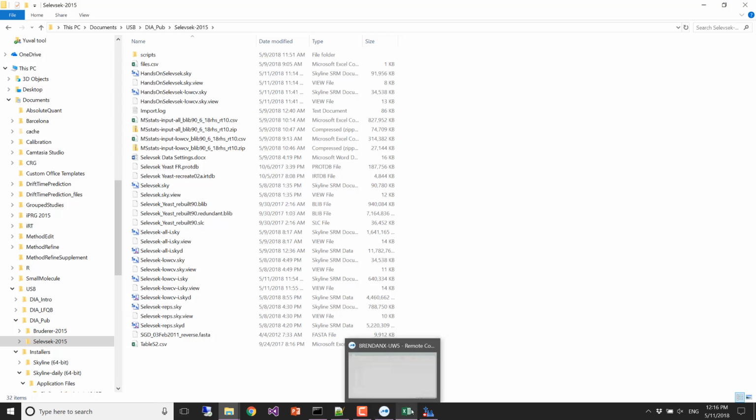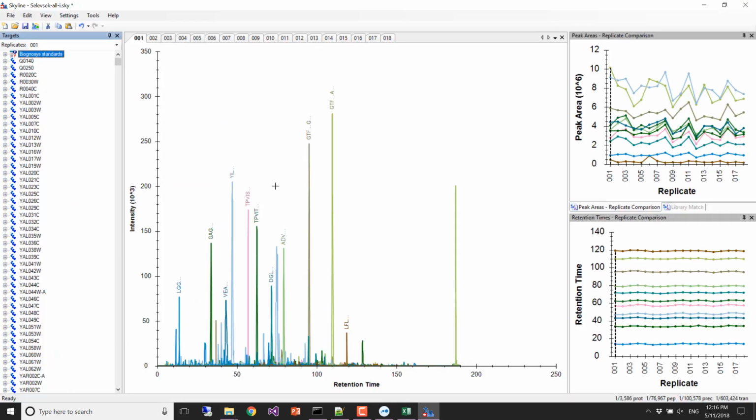So yes, I believe we need discovery proteomics in order to discover things. So we can't always target, but I also think that there may be ways that we can improve the reproducibility that will allow us to have more sensitive quantitative measurements, and that we don't always just have to go like, okay, well, everything that we saw we're going to include in our quantitative analysis.